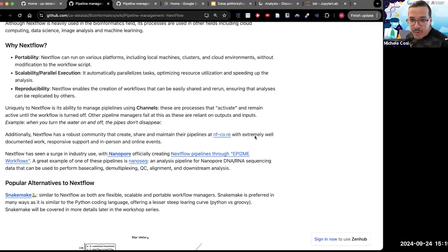There is a comment: the configuration seems like it will benefit from a multiprocessing approach, since parallel processes can proceed while some other processes stall or wait. Yes, exactly. But the thing is that we don't control it. Nextflow controls it itself. It is smart that way. I don't necessarily know how it does it, but it is able to reconfigure where the parallel processing happens. So one of the greatest things of Nextflow, honestly. Thank you for the question, Randall.